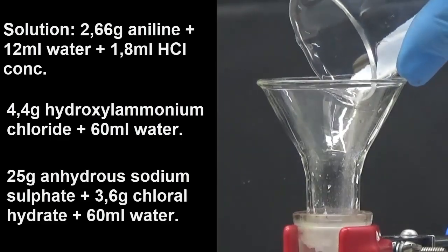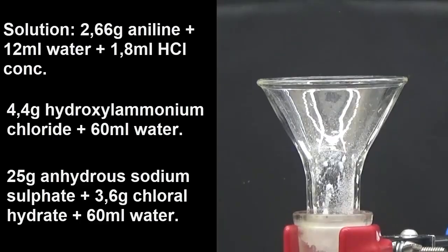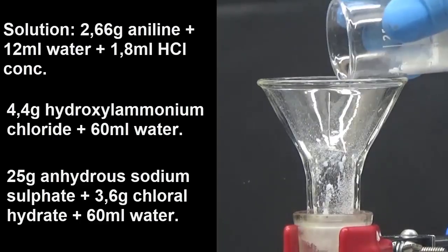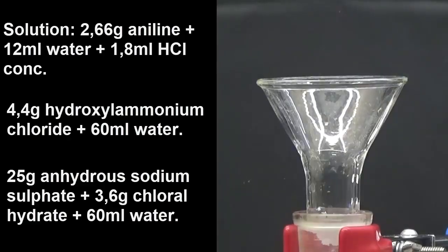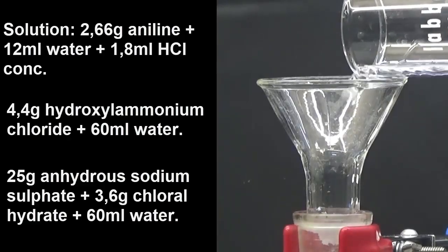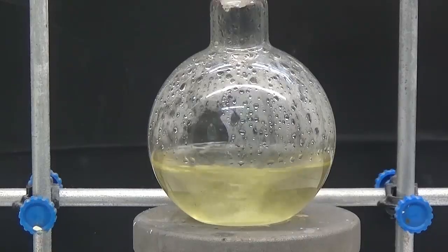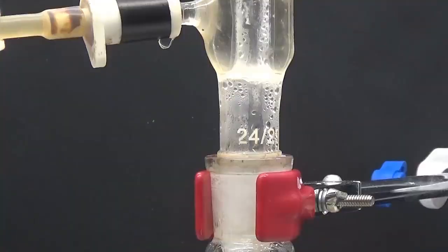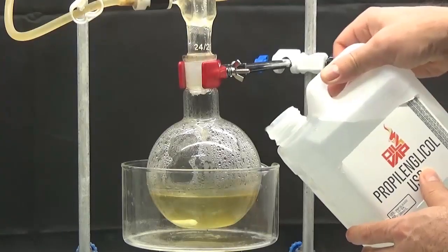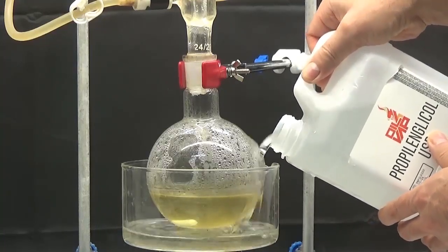Add 25 grams of anhydrous sodium sulfate, 3.6 grams of chloral hydrate and 60 ml of water. Bring to a boil in 15 minutes and keep boiling under reflux for 4 minutes. Remove the heat and cool with water, then with ice or a cooling mixture.